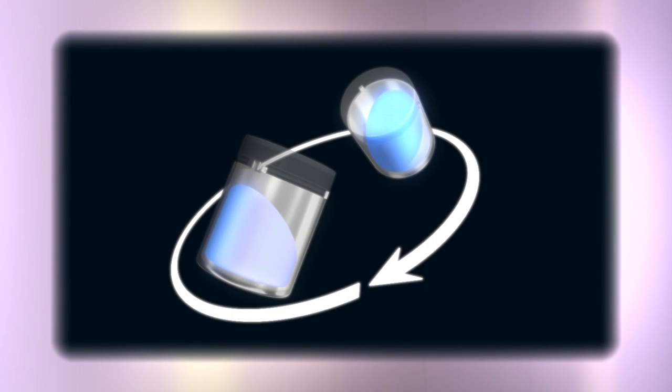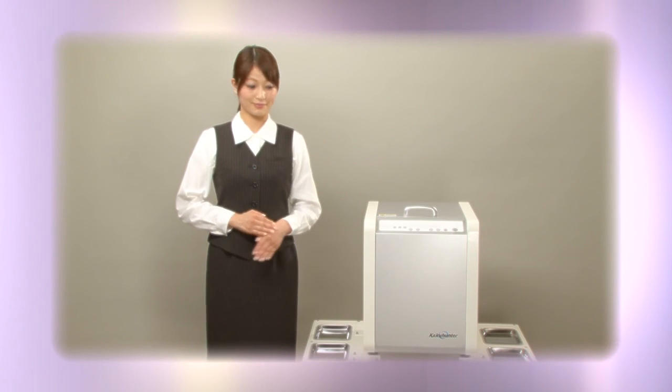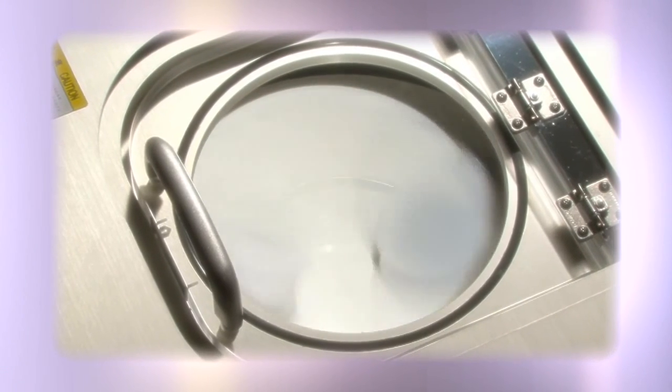Shashin Kagaku's mixer degassers are equipped with sophisticated features and independent control over revolution and rotation speeds. If you have any needs or questions, please let us know by email.